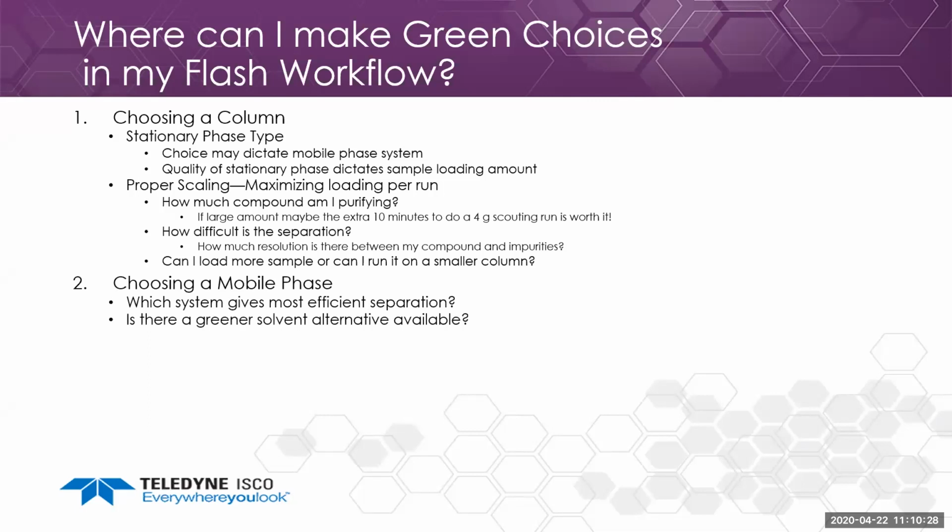The next step would be choosing a mobile phase for your system. Which system would give the most efficient separation?